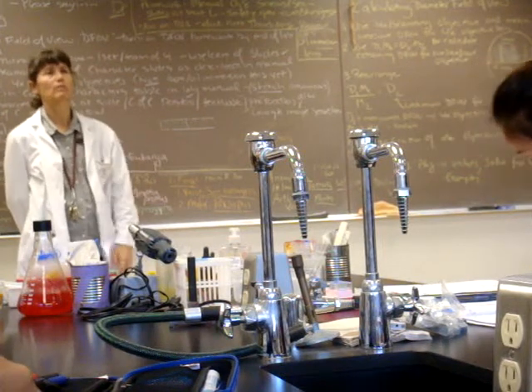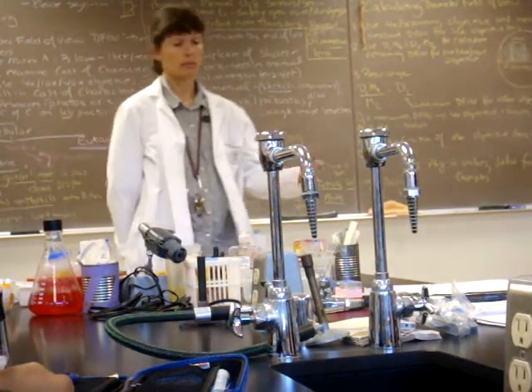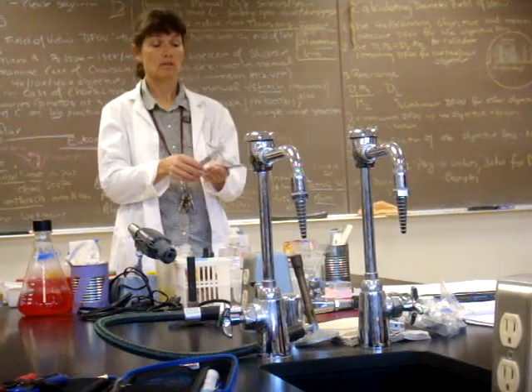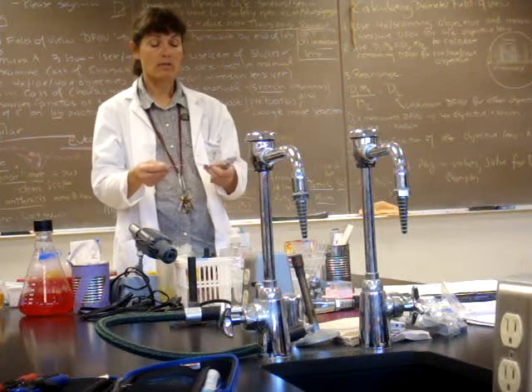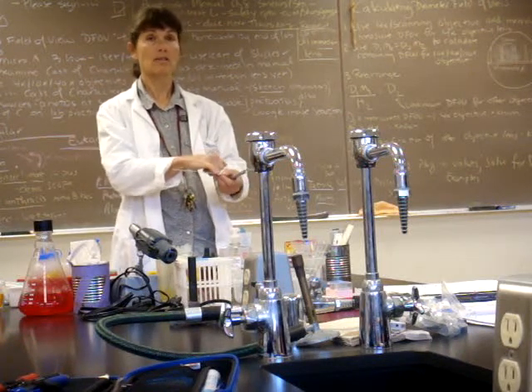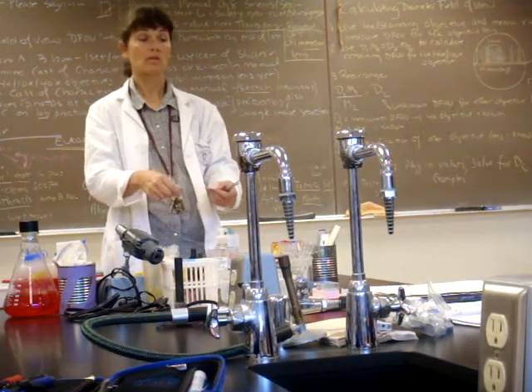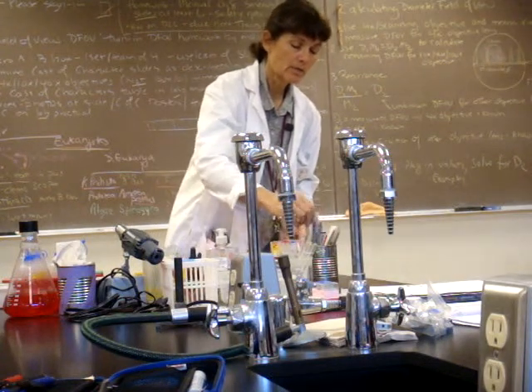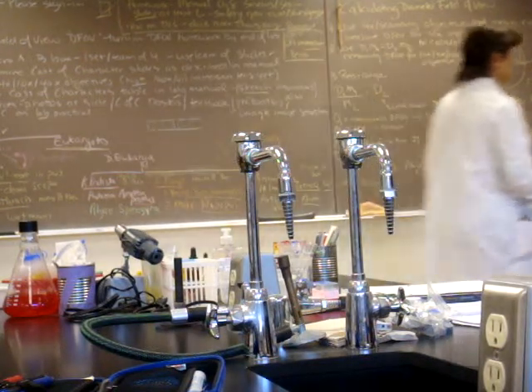It's very important information. The first thing everybody will need to complete your homework is that you'll need to come up and get a metric ruler. These are community rulers, so please return them when you're finished. Make sure that you, with your teammates, know the difference between the English system that has inches and the metric system that has centimeters and millimeters, because you're going to need the metric scale. And what you're going to do is, when you retrieve your microscope, and I'll just borrow one from over here.